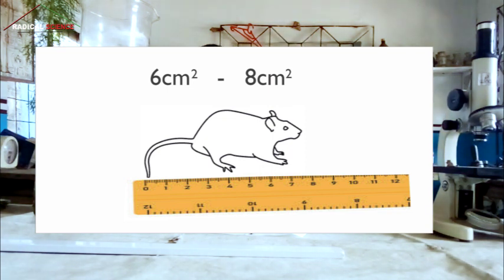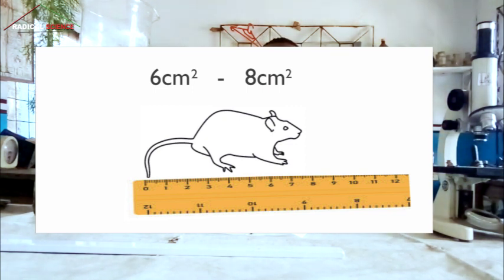But I will always advise students never to draw it up to 8 centimeters, because when you do that, your way of placing the meter rule may differ from that of the marker, and you may begin to have issues. In some cases, some people will tell you to use a block sign, to draw a triangle or a rectangle and measure it from 6 to 8 centimeters. It is not so. Whichever thing you are asked to draw, they will always give you what to draw and the terms to use.